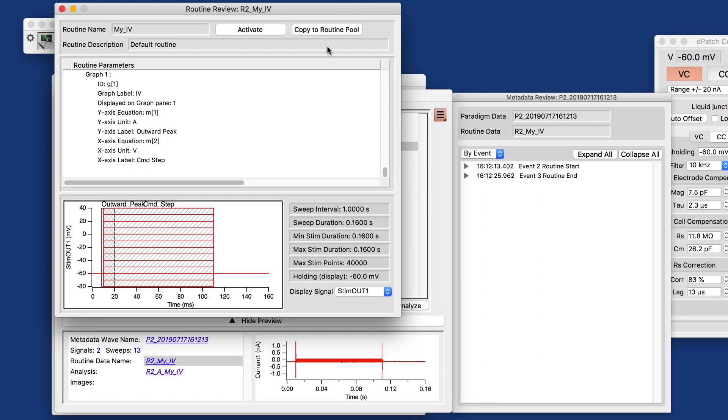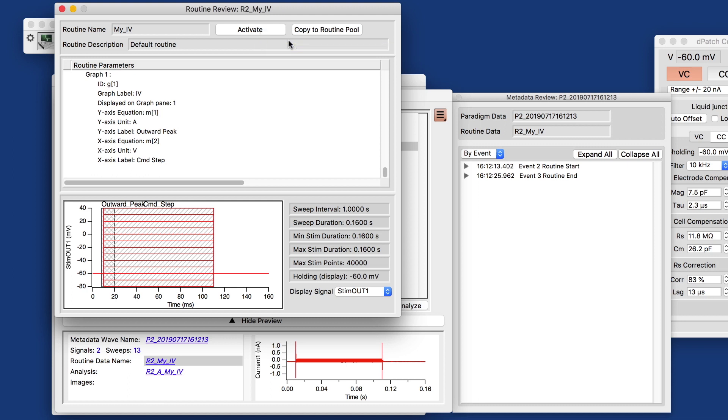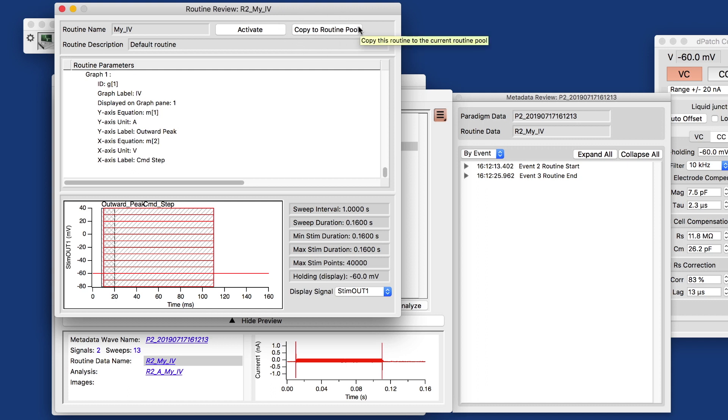And what you can do is you can either copy that to your routine pool or activate it and run it as is. The benefit of that is you can proliferate a routine across multiple rigs that you may have in your lab, or you can reproduce what your collaborator halfway around the world did.